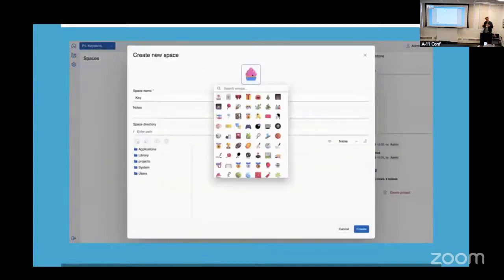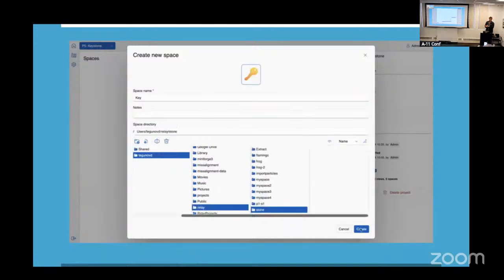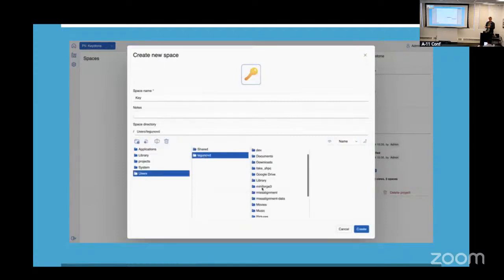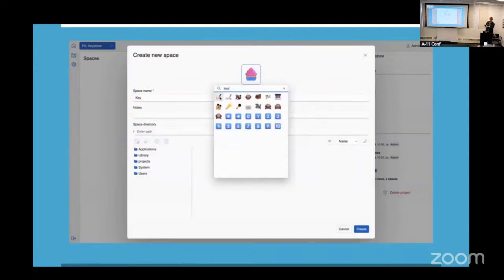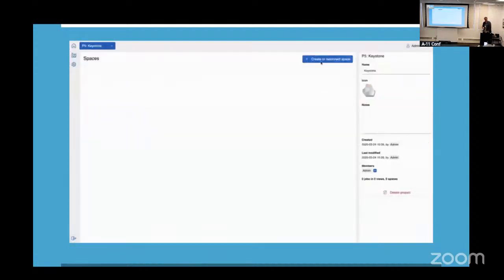Within a project, we then have a sub level that you can organize things into that we call a space. And so what this practically is like one space on disk where, say, multiple data sets, we work in a pharma context, and so maybe we're doing like multiple compounds in a series that we're looking at, something like this. This might be one PhD student's work on a thing over a couple of years, or you can organize things however you want. It's just you have another level within projects that you can split things out into, and all of these things will be co-located on disk. And so that's how that goes.